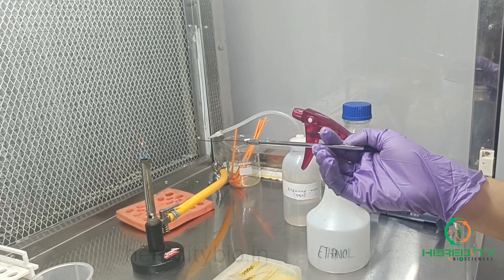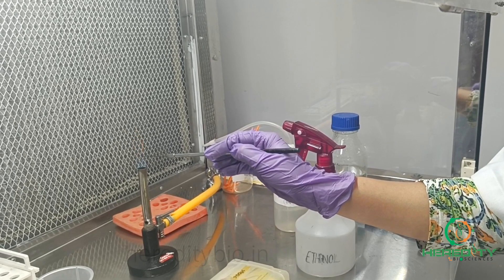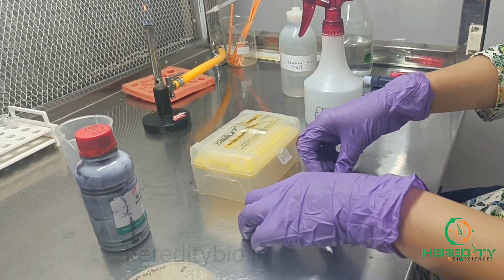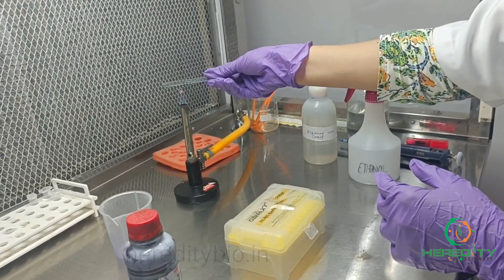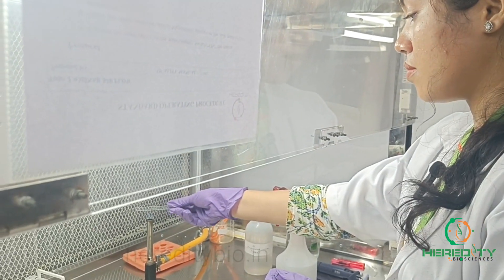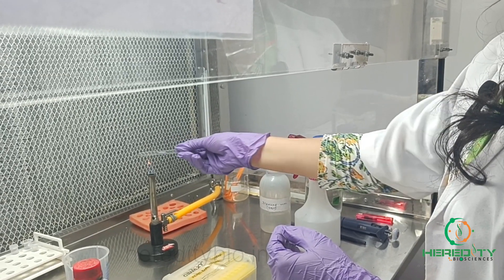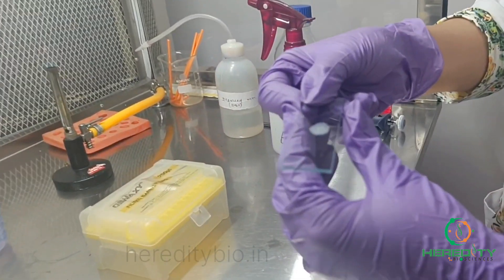After the use of this inoculation loop, we'll again sterilize it to make it contamination-free. Then we'll heat fix the smear. Heat fixing is done so that the bacteria will adhere to the glass slide and it will take the stain in an even way. Here we can see heat fixing has been done in a proper way.